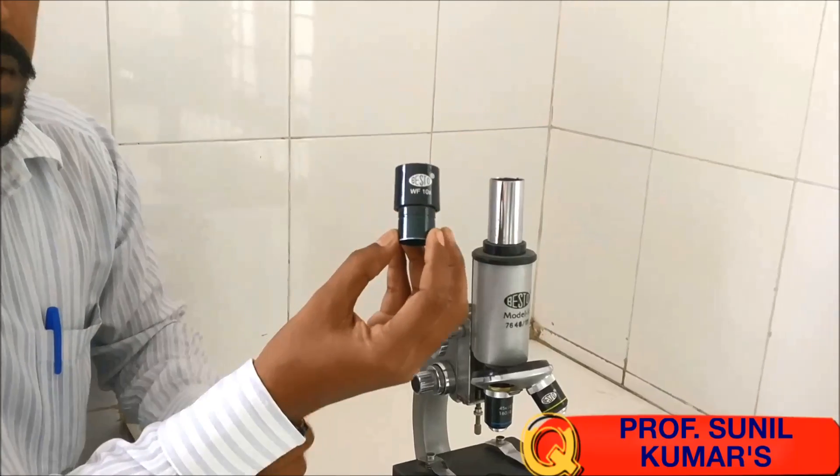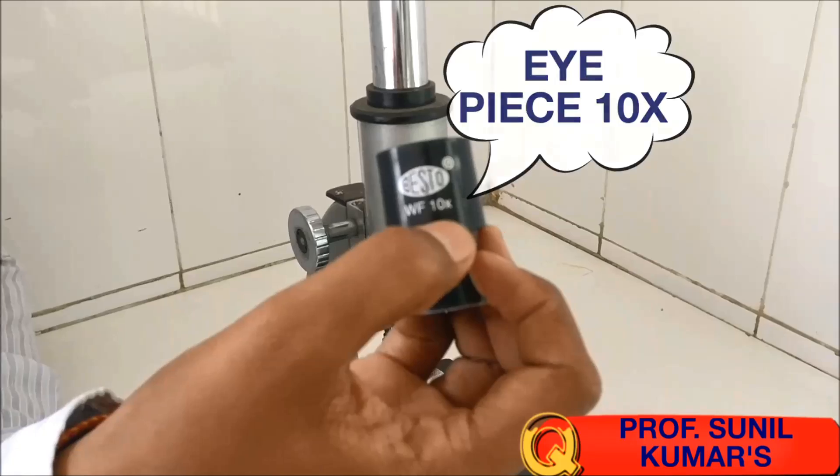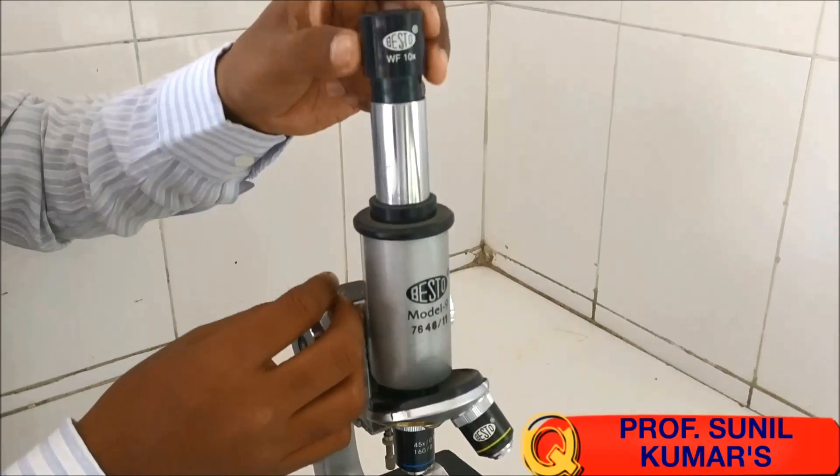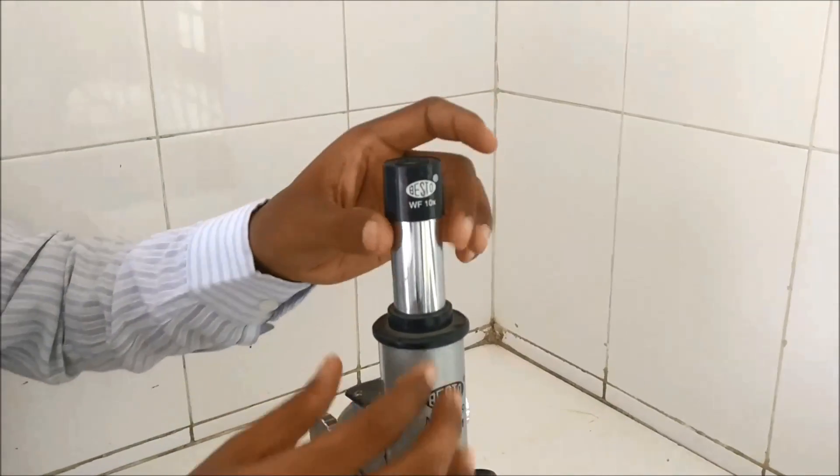Let's explore the parts of the microscope. This is the eyepiece — when you look at it, it is 10x. 10x means it is going to zoom the organism or the cell 10 times. The eyepiece is the place where you place your eye.